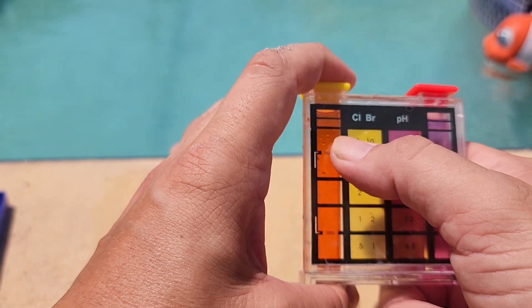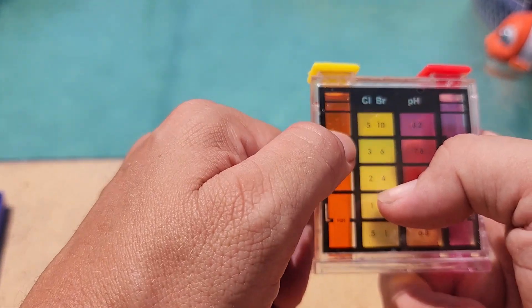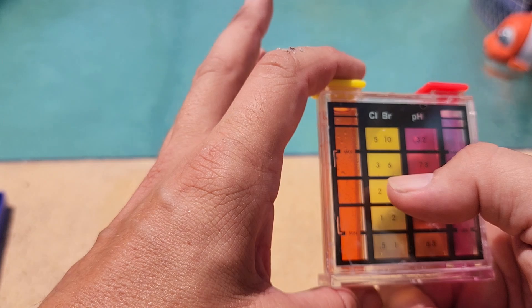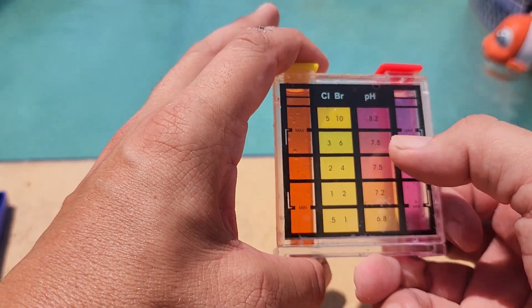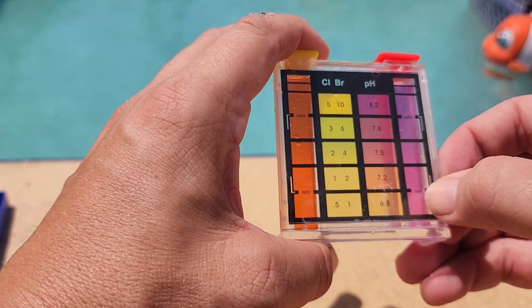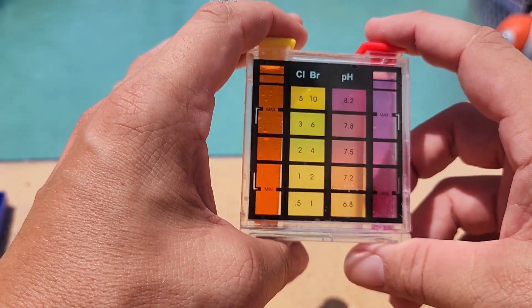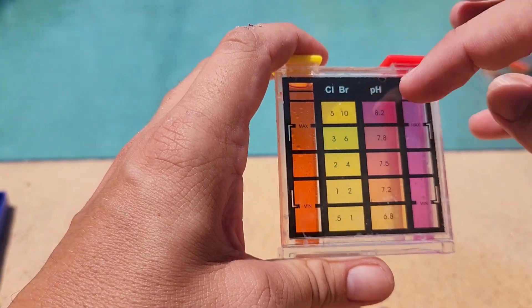My chlorine is probably high because I added a bunch of shock yesterday. I was having issues with algae, shocked the pool, and that put my chlorine up in the 10-ish range, which is why it's orange instead of yellow. You want to keep chlorine between 1 and 3, and pH between 7.2 and 7.8. The white lines on the kit show the minimum and maximum for each. I'm out of range because I was dealing with algae, but this test kit works really well.